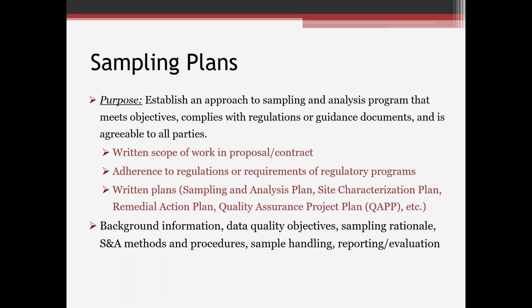And then going into sampling plans. Like I said, we don't want to go into sample analysis blind. You want to have some sort of plan going in, regardless of whether it's just initial characterization of a site, or a remedial site where you have specific criteria as far as how many samples you have to collect, where you have to collect them, when you have to collect them, and all that. But it's good to have something agreed upon.